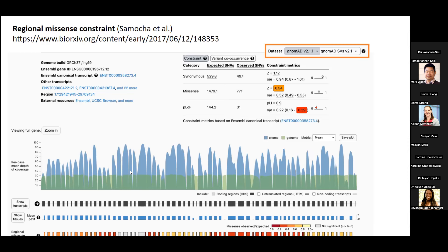One cool addition to the regional missense constraint track I want to mention: if you highlight over any segment of the regional missense constraint track, it will tell you the genomic position as well as the amino acids covered within that segment. Not all of the breakpoints fall at the edge of an exon, so that information is particularly useful.